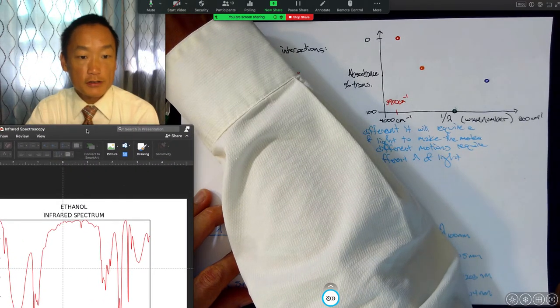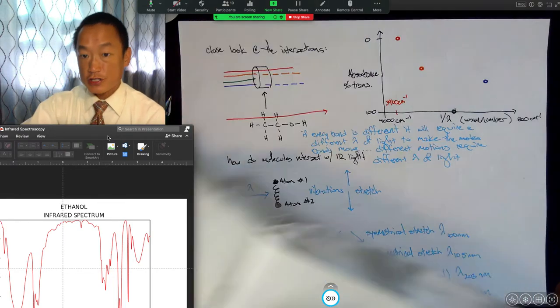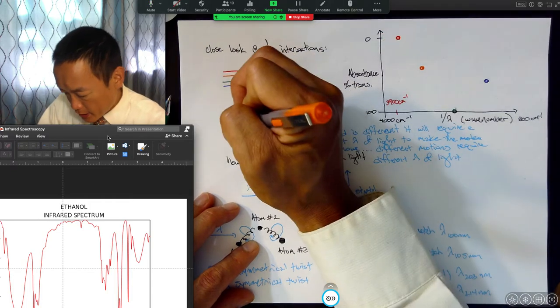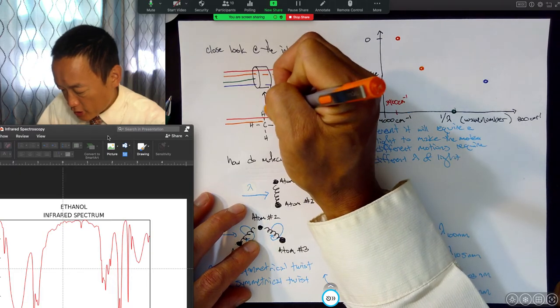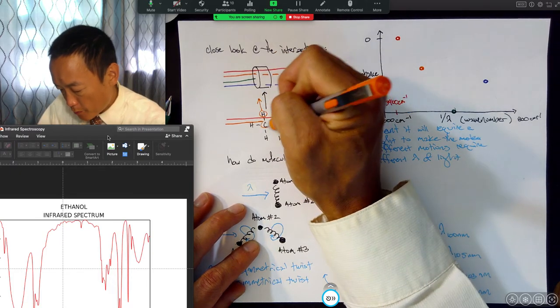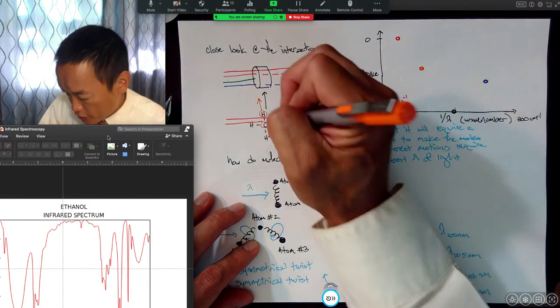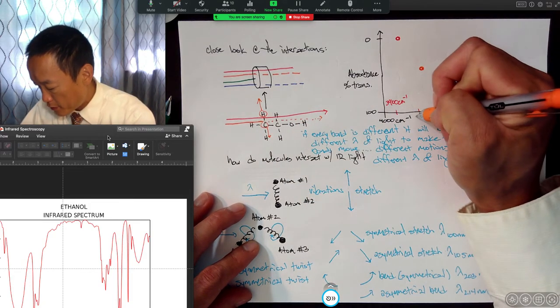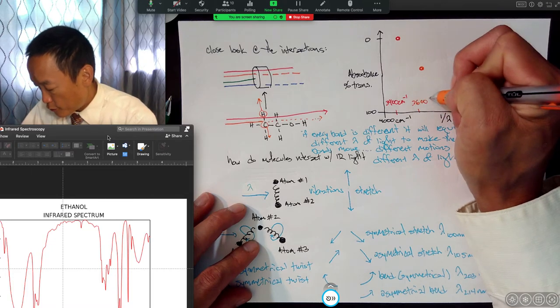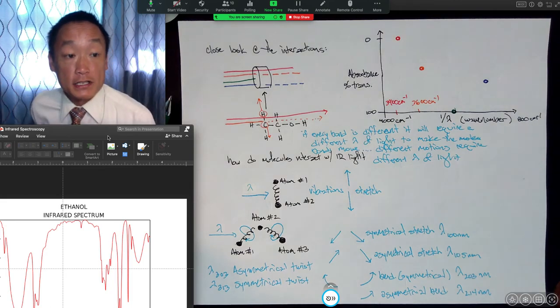I'm going to try and do some double time. I wrote 3,900 right here. And maybe this orange sample then, some of that light hits this right here, and all of a sudden it causes this hydrogen to move way up here and this carbon to move way down here. And some of that energy is absorbed and some of it's not. And so maybe some of that energy gets absorbed by the sample and you end up with here at maybe 3,600 inverse centimeters, where some of that energy was tuned perfectly for that bond, and it started to make those atoms in that bond wiggle and move.